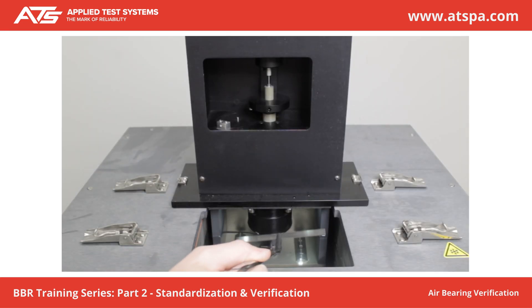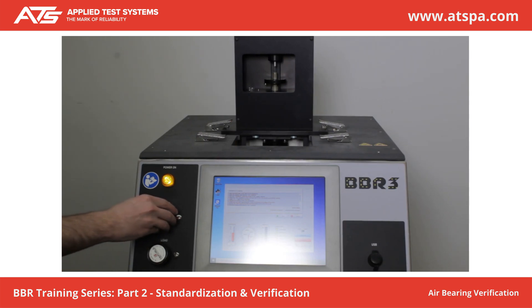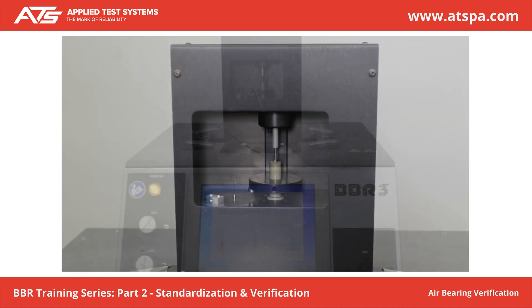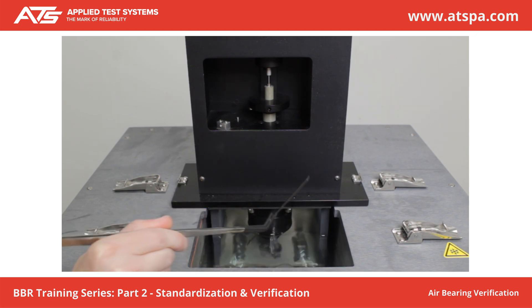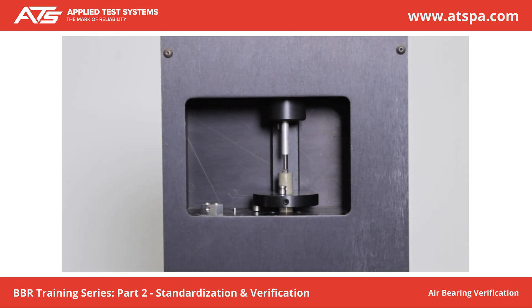Place the confidence beam on the sample supports. Adjust the zero regulator to lower the load shaft to the zero position. Apply a 35 plus or minus 5 mN load to the beam. Observe the reading of the LVDT. Gently raise the shaft approximately 5 mm and release; it should smoothly float downwards and contact the beam. Raise the loading shaft, remove the confidence beam, then adjust the zero regulator so the load shaft is free floating at the approximate midpoint. Place the 2 g mass on the weight pan — the shaft should slowly drop down under this mass. Mark Verification Complete if observations are satisfactory. Press Next.